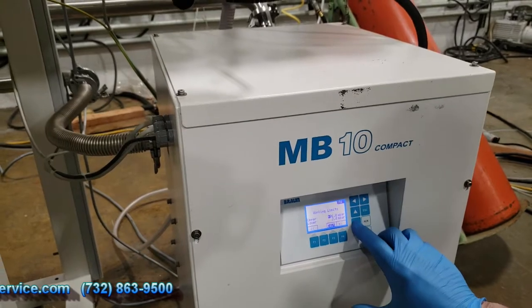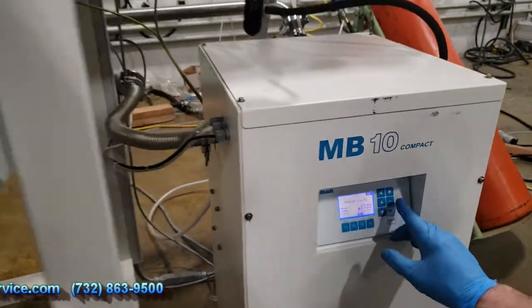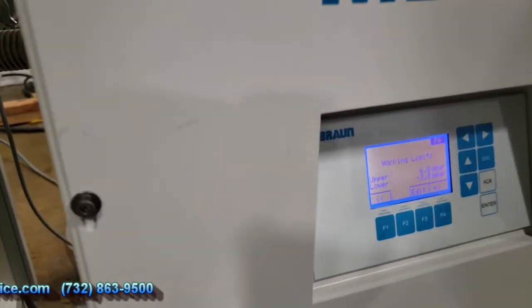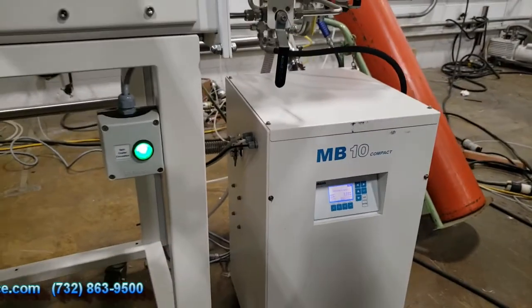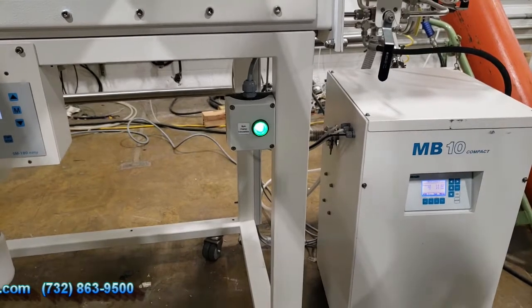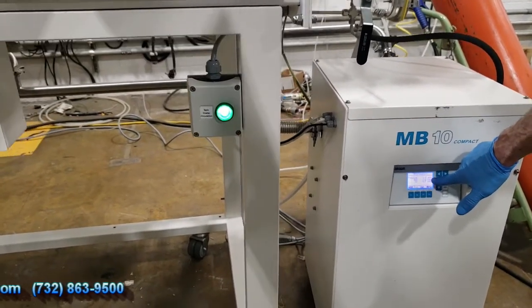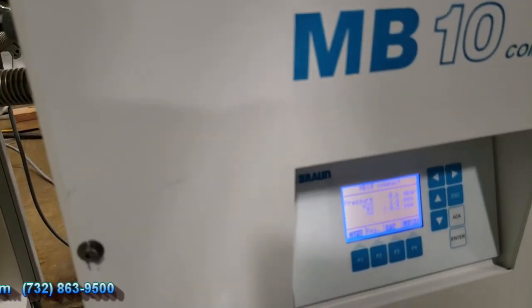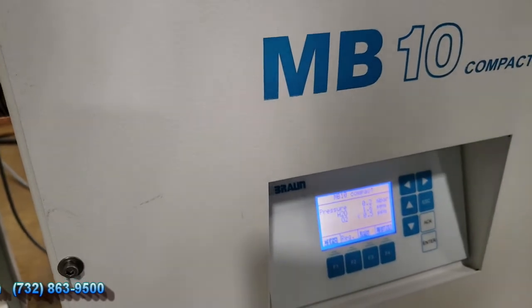Again, hit edit, enter, then hit the lower and I'm going to change that to a negative, and enter. At this point using the foot switch I'm going to go ahead and reduce the pressure. I need to get back to the main menu and I'm watching my pressure here. I'm just going to bring that to around zero. I can stick my hands inside.